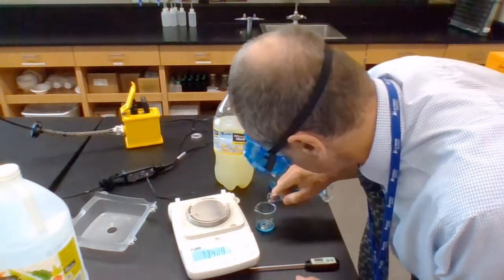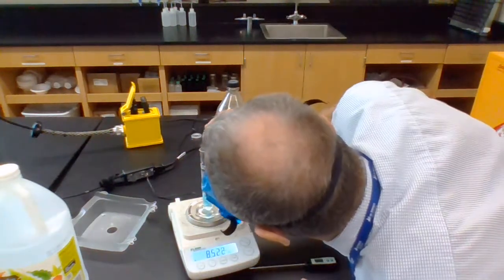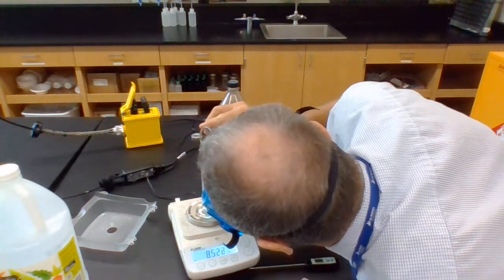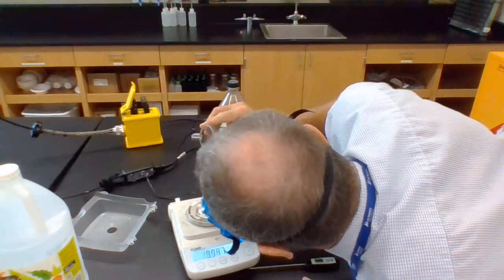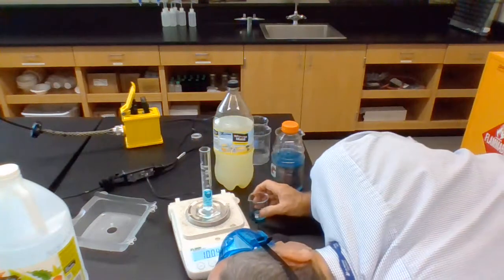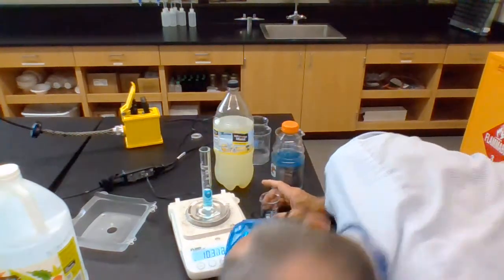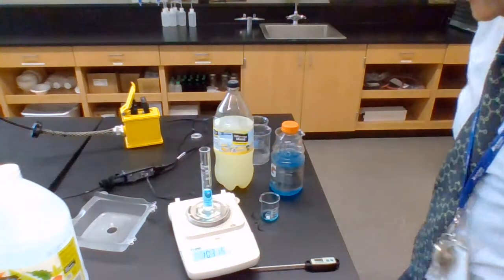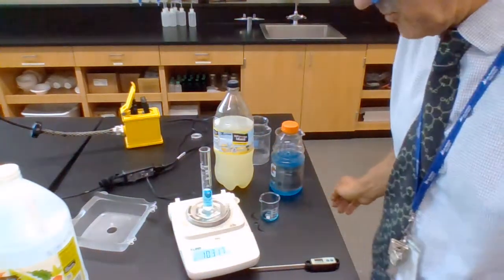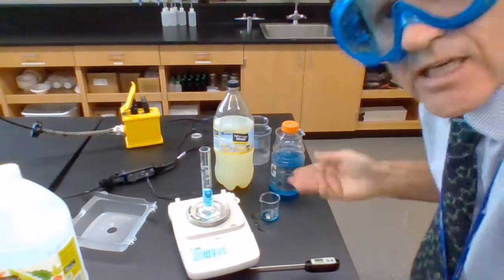Drat. Almost. The top of the meniscus is at 10. The bottom of the meniscus is at the 10. Now that reads 10.317 grams. And this is 10 milliliters.